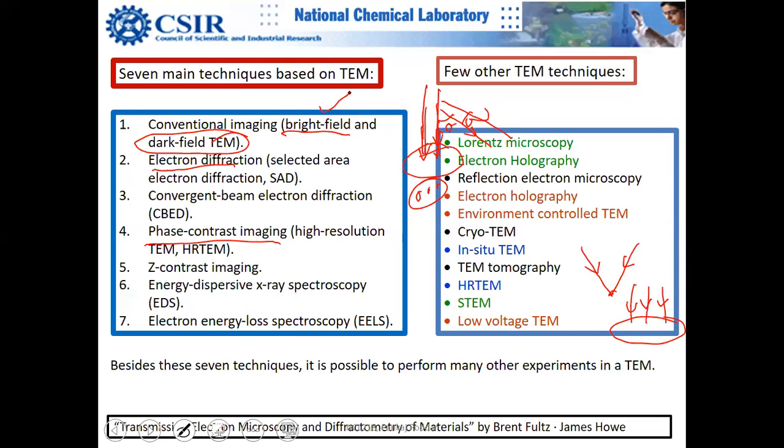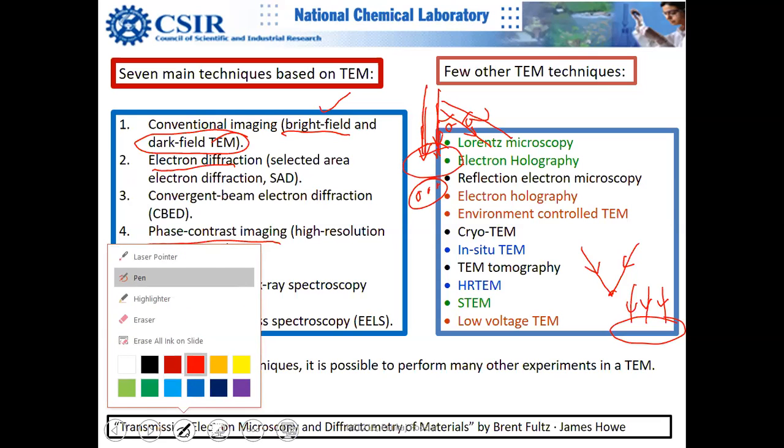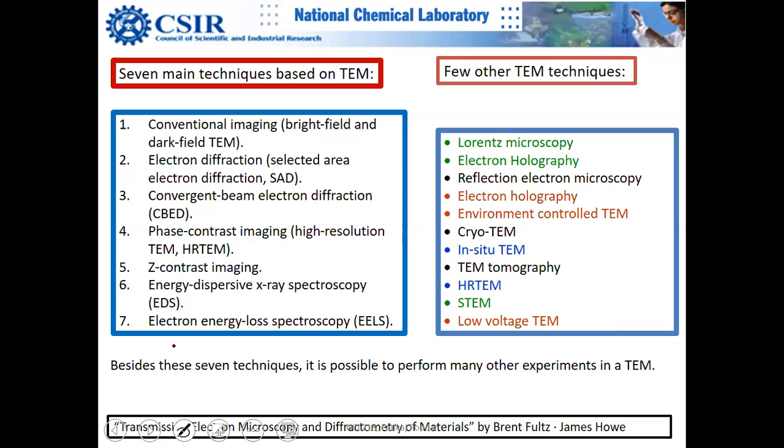The next part is electron energy loss spectroscopy. This has been discussed earlier, but I'll be discussing it later on as well. These are the electrons which undergo some loss when they interact with the atom or lattice, actually, the periodic arrangement of atoms. When I say atom and when I say lattice, the interaction is very different.